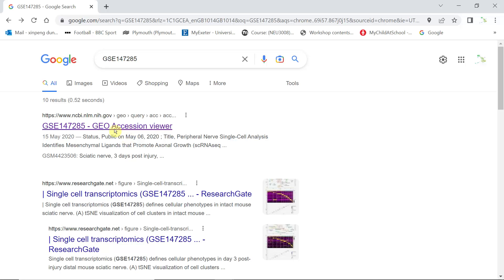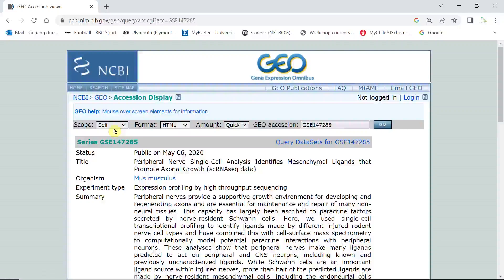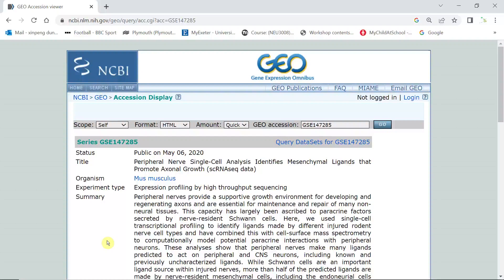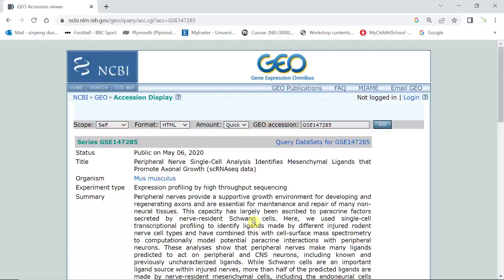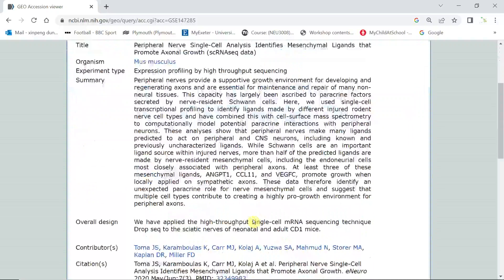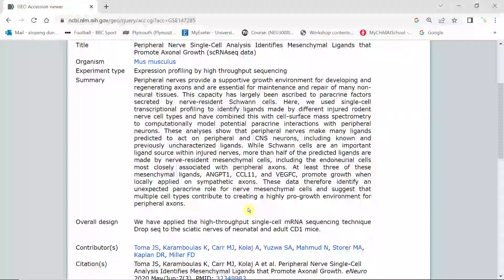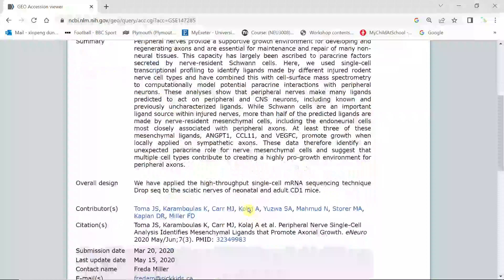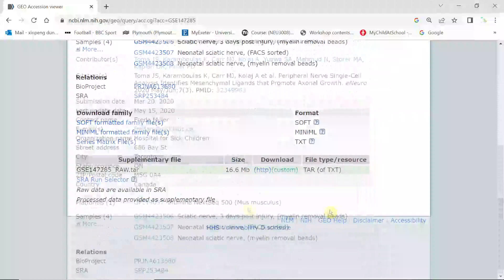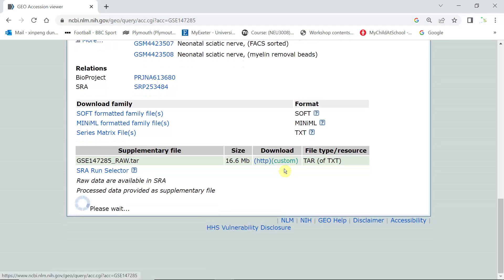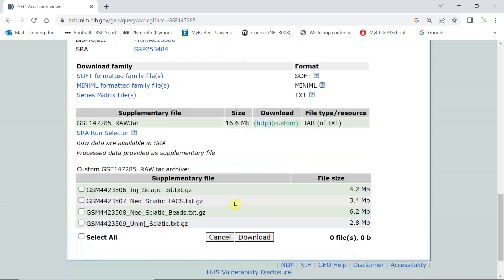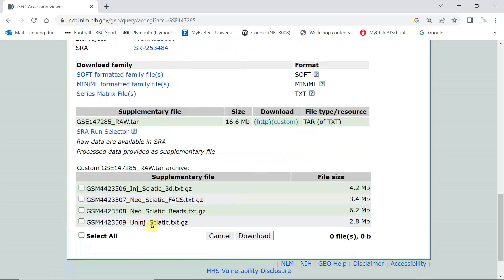If you click the link, we can see the data. This dataset performed single cell RNA sequencing analysis on mouse sciatic nerve before injury and three days after injury. I'm going to download the intact sciatic nerve sequencing data for today's demonstration.